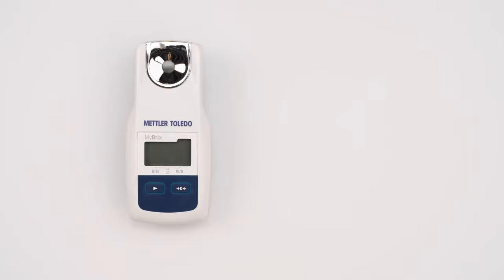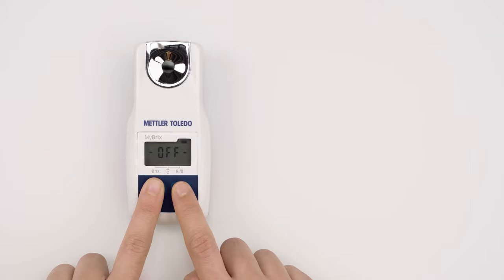Press the read key to turn on the instrument. To enter the scales menu, hold the read key until OFF is displayed, quickly release the read key, and then press and release the zero key.